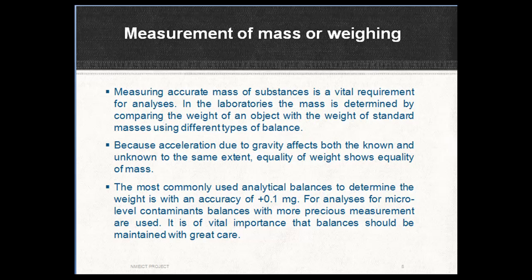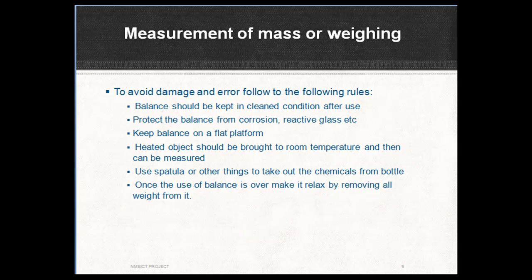It is of vital importance that the balance should be maintained with great care. To avoid damage and error, follow the following rules. Balance should be kept in a clean condition after use. Protect the balance from corrosion and reactive glass. Keep the balance on a flat platform. Heated objects should be brought to room temperature and then measured. Use a spatula or other tools to take out the chemicals from the bottle. Once the use of the balance is over, let it relax by removing all weight from it.